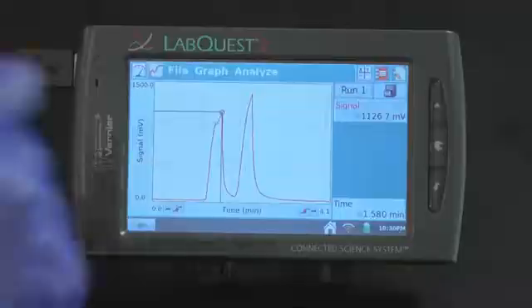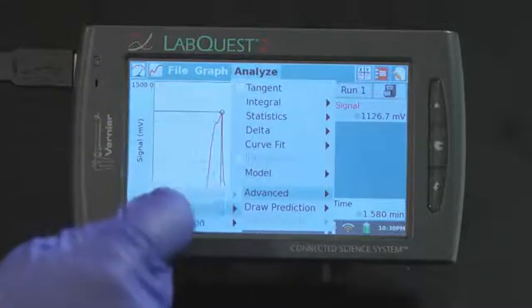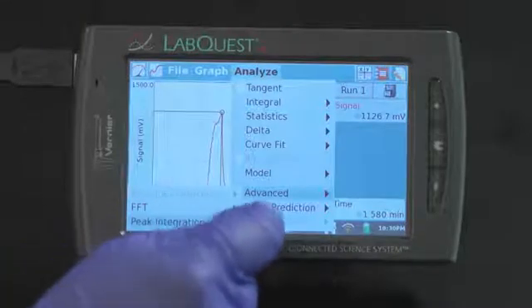Another analysis tool is peak integration. Tap on Analyze, choose Advanced, choose Peak Integration, then Signal.